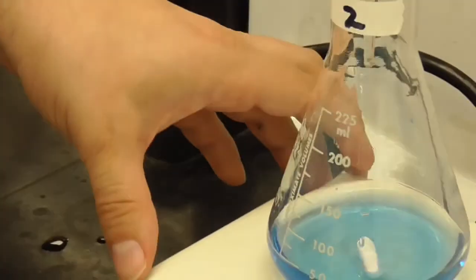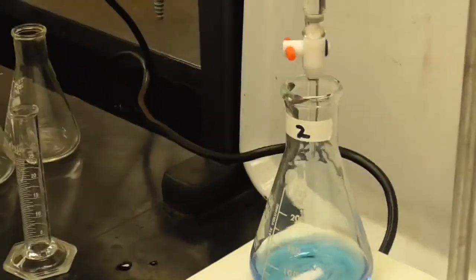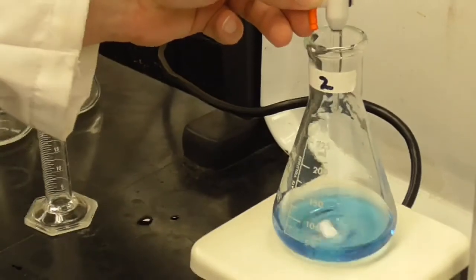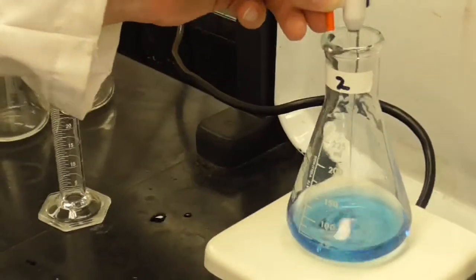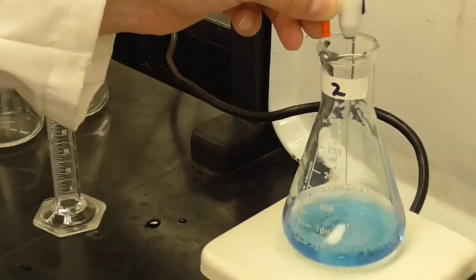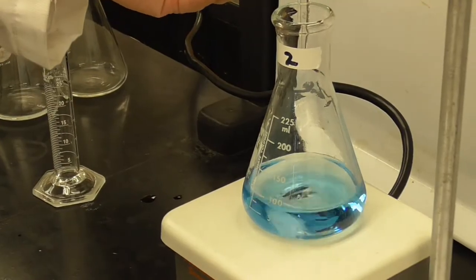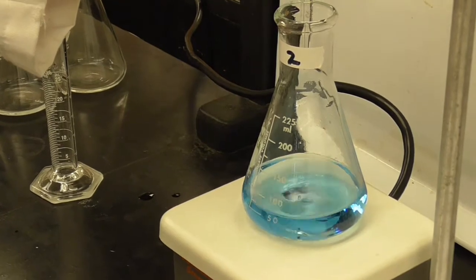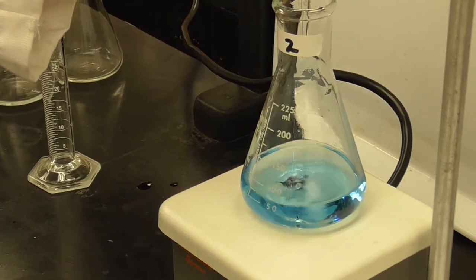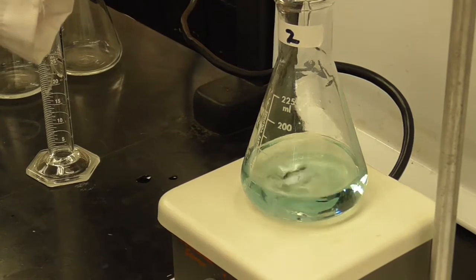Dr. Dene is going to titrate it. We're going to pause the video while it's titrating so that you don't have to watch all of the solution going in there. So he's got it started, and we'll tune back in when we get closer to the endpoint. Okay, we're close to the endpoint now. So we're going to be adding the hydrochloric acid a little bit more slowly, and it's green.